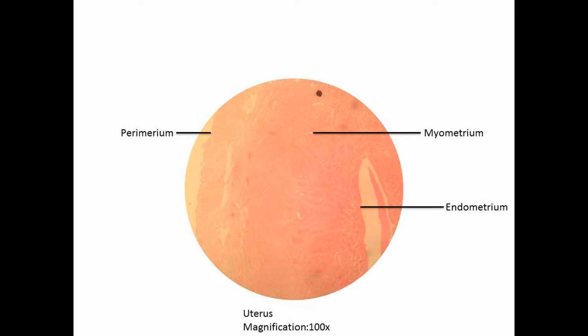Okay, inside the myometrium is the endometrium layer that borders the hollow lumen of the uterus. The endometrium is made of simple columnar epithelial tissue with many associated exocrine glands and a highly vascular connective tissue that provides support to the developing embryo and fetus during pregnancy.